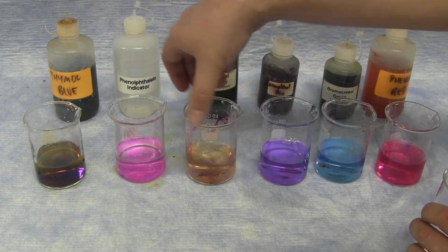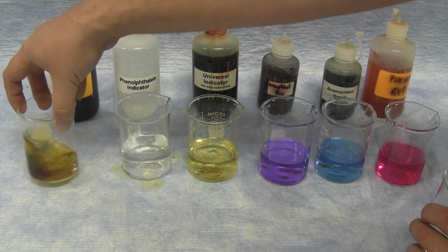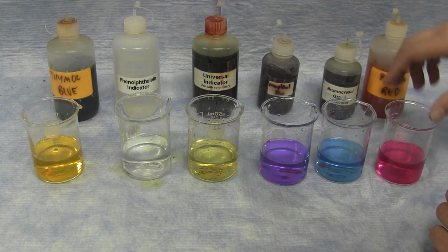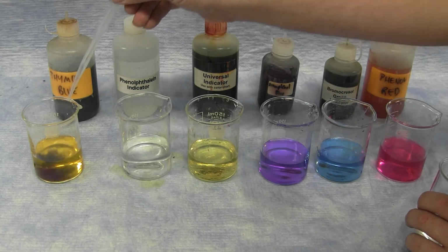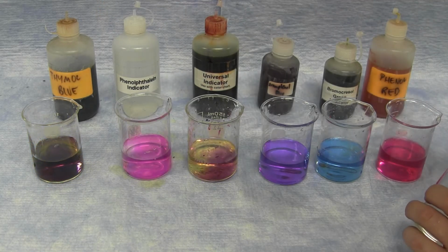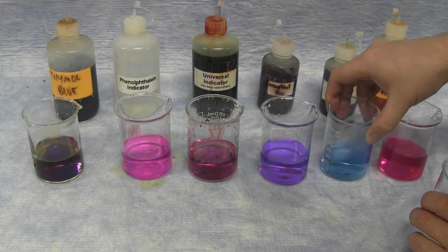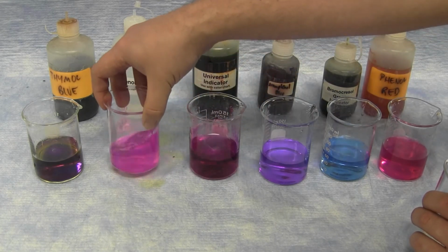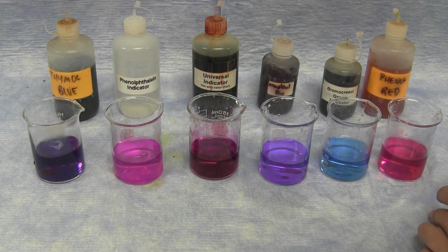The universal indicator is now a yellowish color, and the phenol red has now changed color. The universal indicator and the phenolphthalein both have been able to change color, as well as the thymol blue.